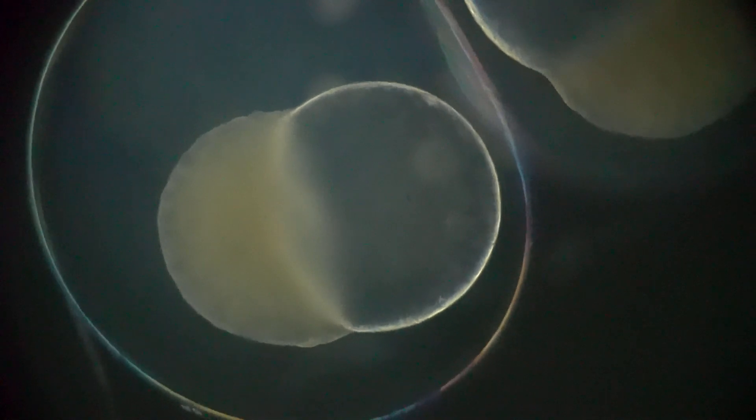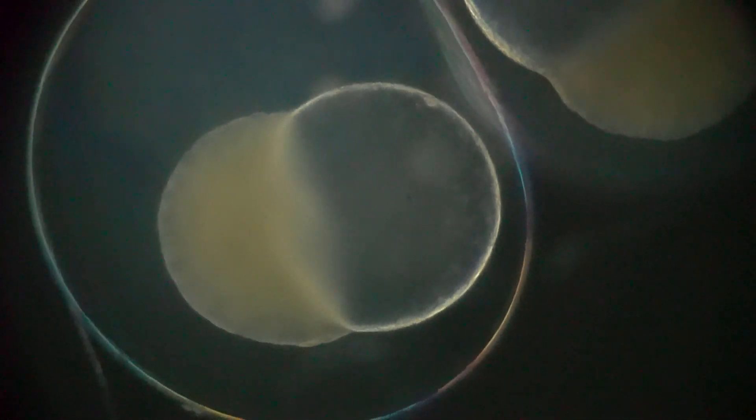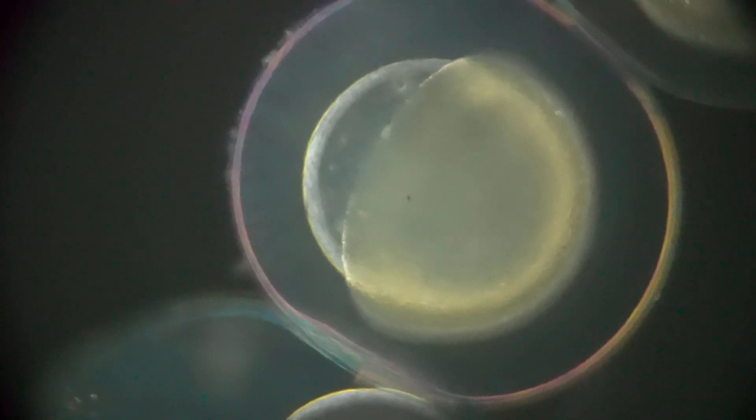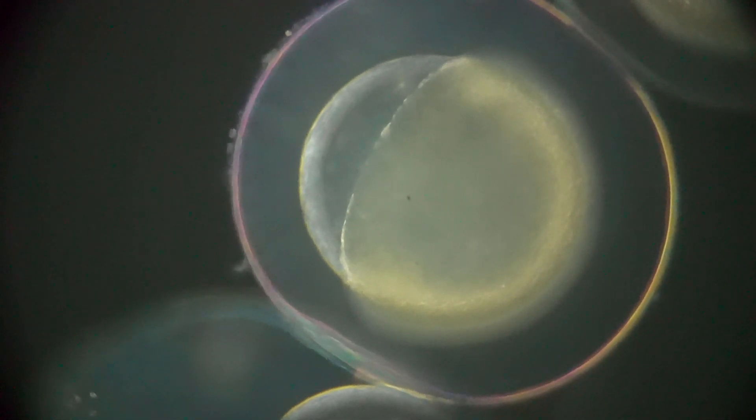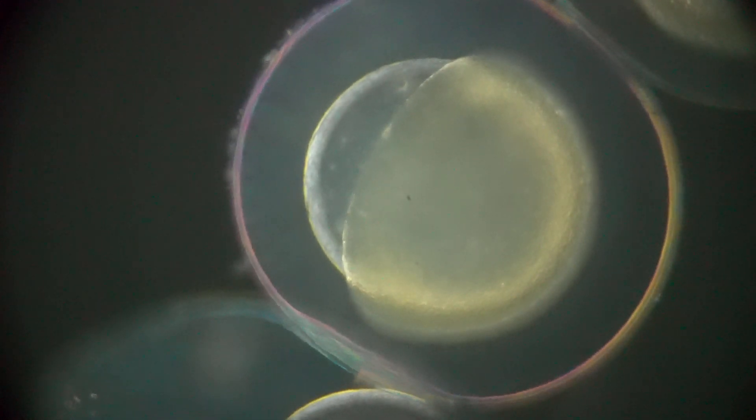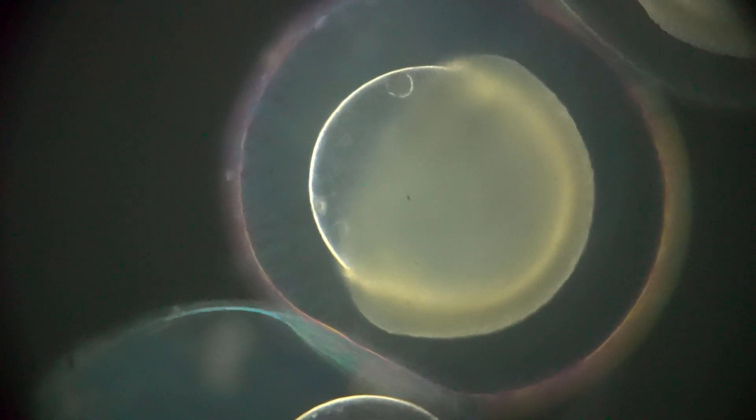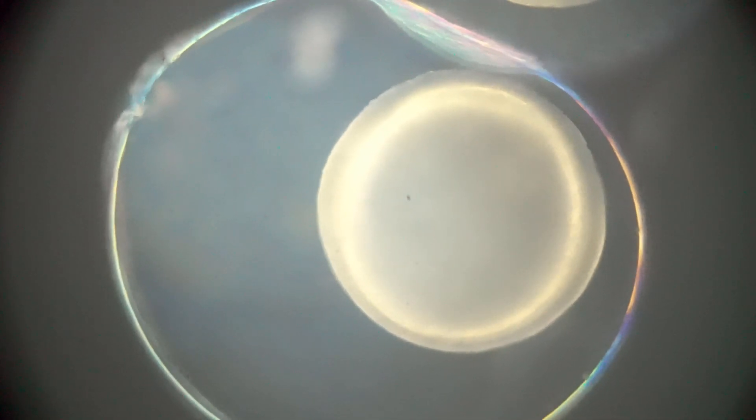Now as cell division continues it gets a little wild and you get way beyond 512 cells, but you can see that the zygote is divided into two different sections. You have the animal pole and you have the vegetal pole. Now the vegetal pole is pretty much the yolk and the ovum. As we go along here, these cells start to actually create more of a plastoderm with an outer protective layer and it slowly engulfs the whole ovum.